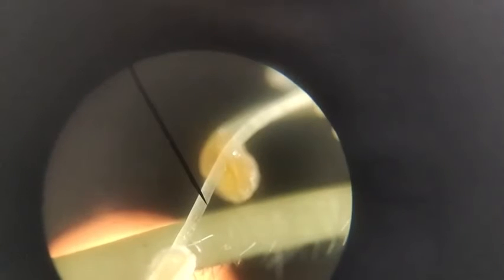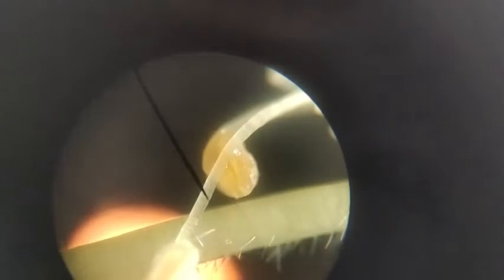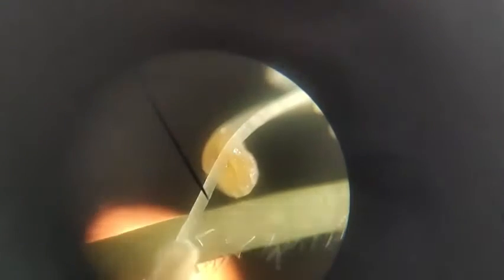You see the anther here is more obvious, and it is yellowish in color. So there are pollen grains stuck on it. And you see that thicker stem, and the tube going exactly in the middle of them. And it has some hair-like structures on it. That one is the female style, which ends in the stigma. I will show it to you because I need to change the position of the slide a little bit. It's such a beautiful sample.